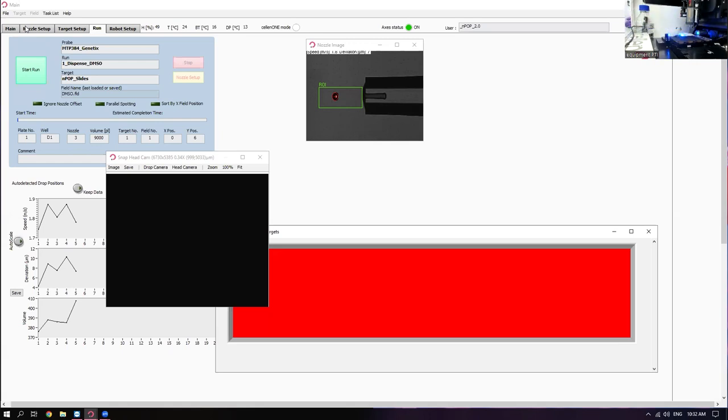And then that lid on there keeps the acetonitrile from evaporating over the course of the run. So you're still at about 50-50 at the end, as opposed to what you might be if you didn't have a lid on there. All right. So next we do our cells. We'll take our DMSO out of here and move it again for our labeling procedure.